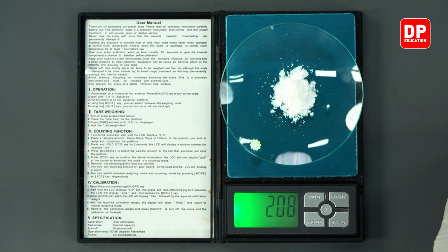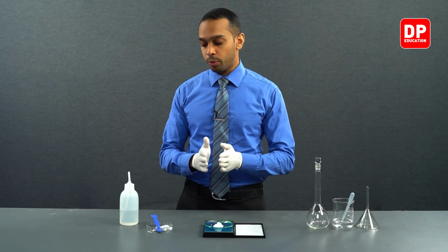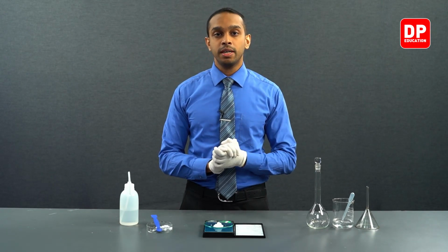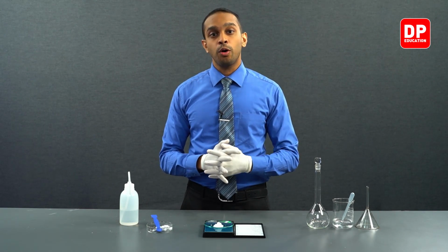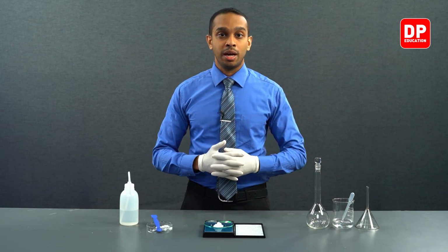As you can see, we have now measured 2.08 grams of potassium oxalate. We can now move on to transferring this 2.08 grams of potassium oxalate onto a volumetric flask. And while I was measuring, I got reminded of a very important characteristic that a primary standard should have.